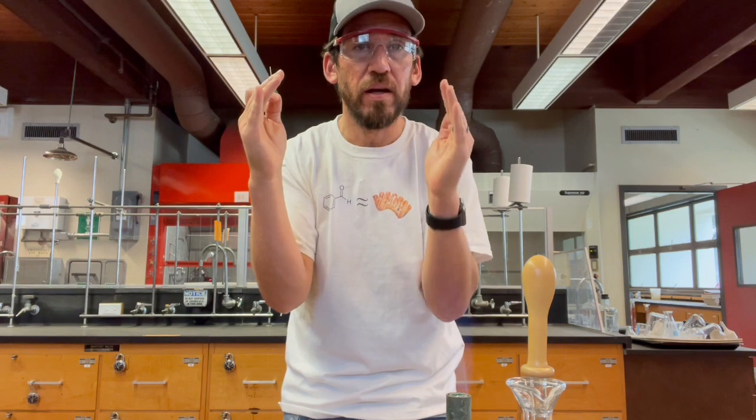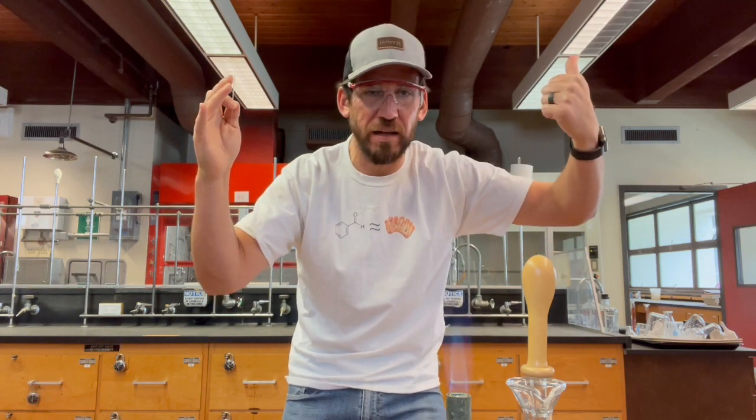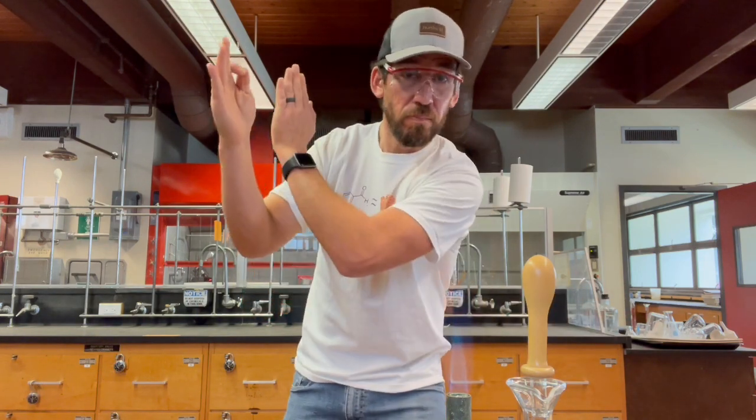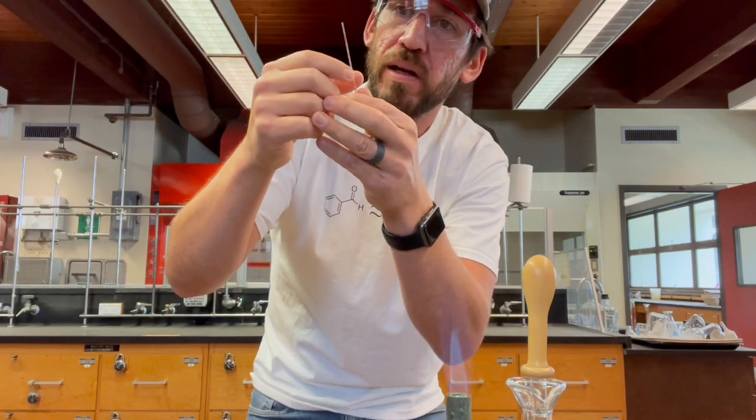And then it's going to start cooling down, and then that gas inside the microbell is going to condense, and it still has to occupy the entire volume of that microbell. And so as it condenses into a smaller volume, the rest of it is going to fill up with the ethanol solution. Okay, so the microbell is this big, then the gas expands to this big. So all this extra stuff pushed out as bubbles, and now we still have this microbell completely filled with hot air. As it cools to cold air, it occupies, let's say, half the volume, and then the rest of that volume needs to be occupied by liquid because that's all that's there. So it sucks it up, right? So, boom. And then the point at which the liquid goes up into the microbell is your boiling point. Bada bing, bada boom.